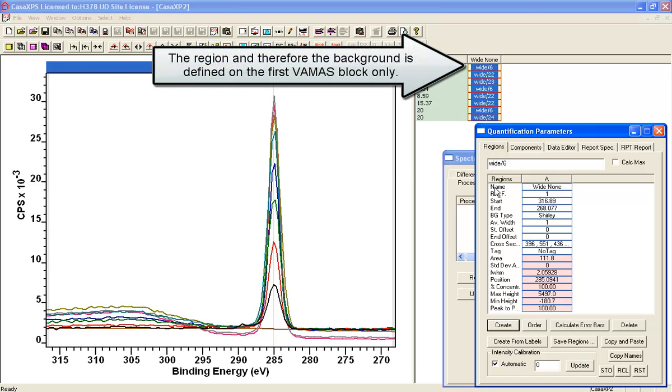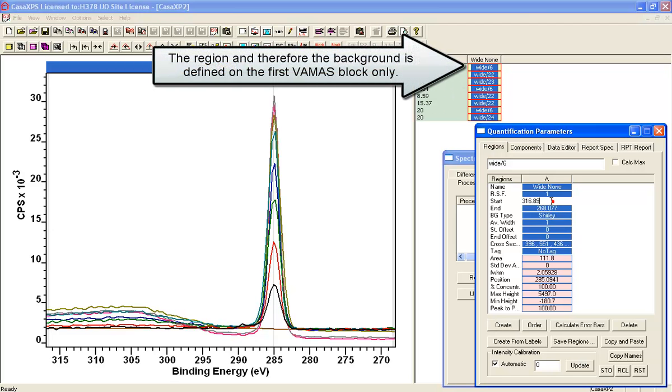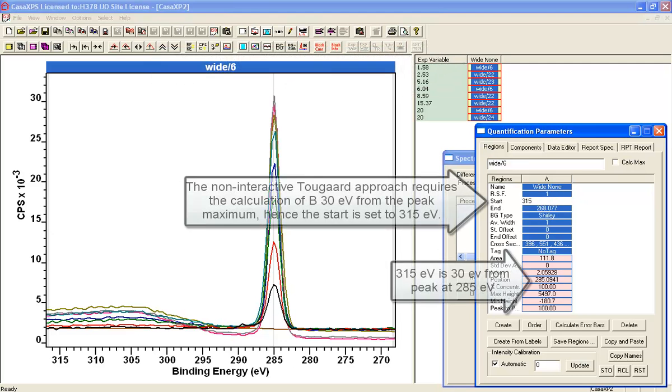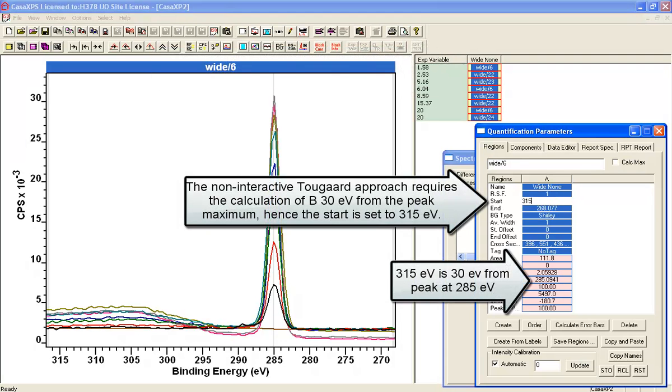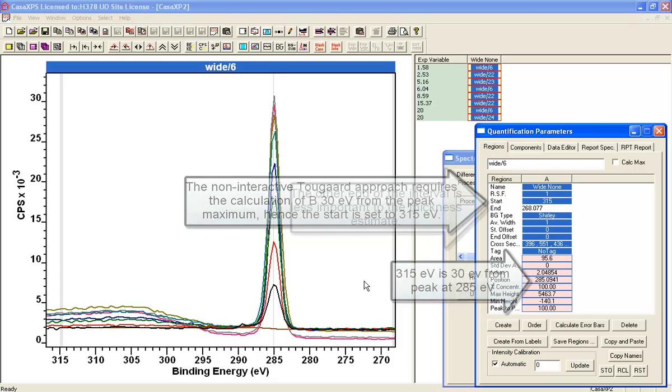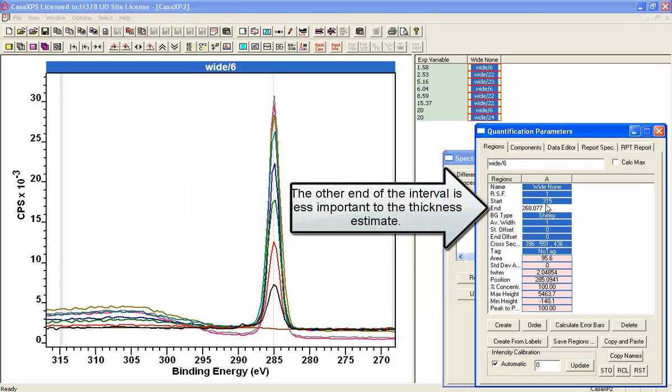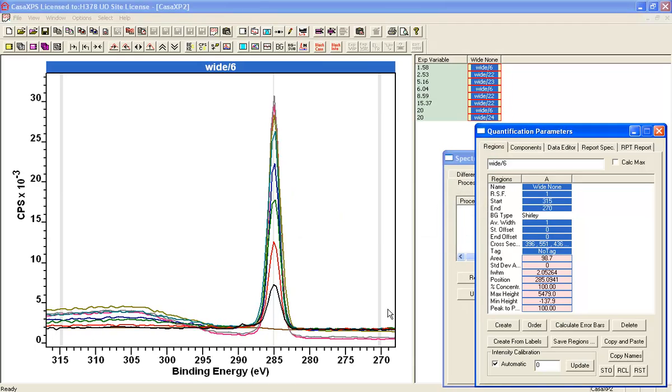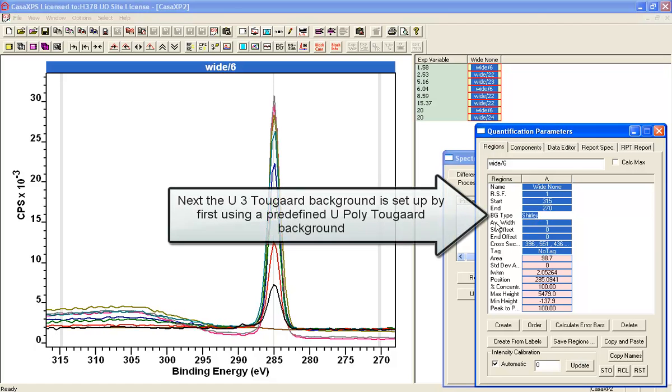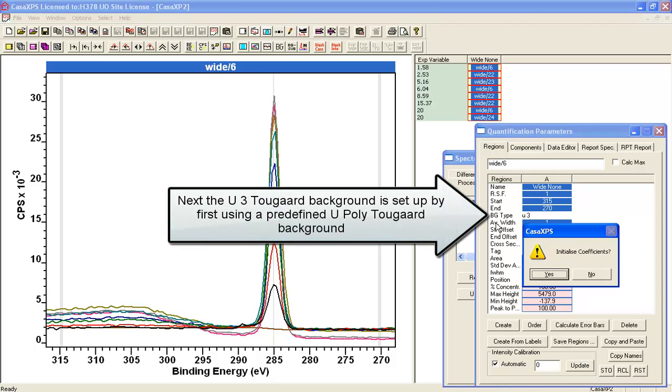So what I'm going to do is specify that this should be 30 eV ahead of the peak position. So I've set that at 315. And on the other end, I'm going to specify 270. And this gives us an interval. And I want to use a U3 2GAR.